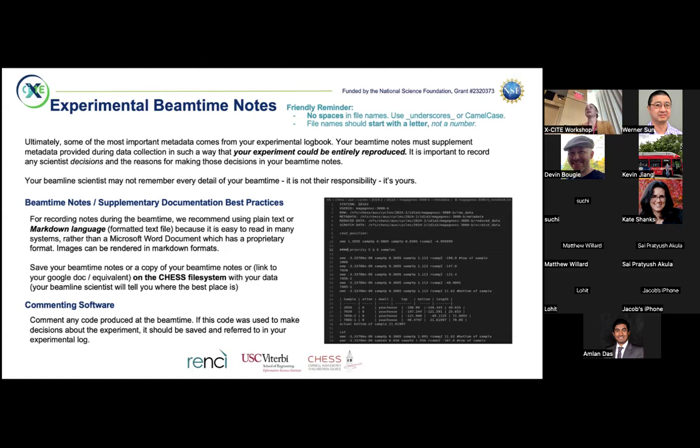One thing I didn't mention in here, but it is important, my colleague Kate mentioned it yesterday to me, is to really leverage collaborative Beamtime notes. A lot of these data are being collected on a team. It doesn't make a lot of sense to take 10 different individual lab notebooks that are all a little bit different. Really leverage using a central resource so that you can all go back to that collectively and make sure that all the information was captured.